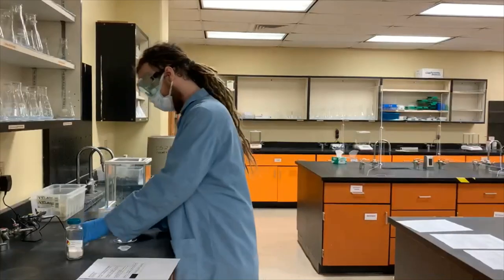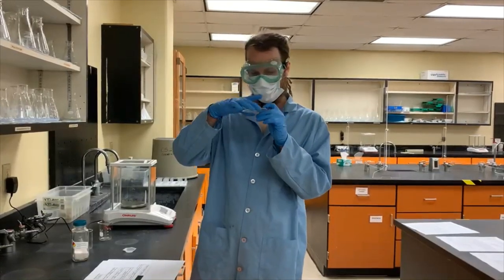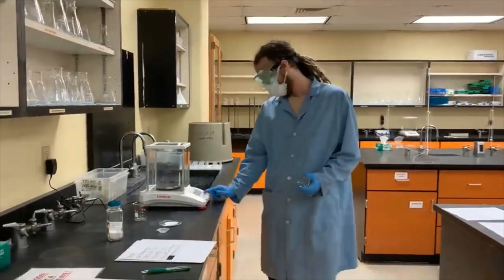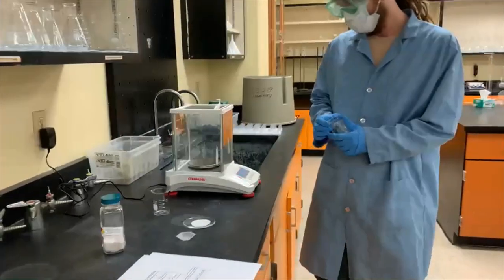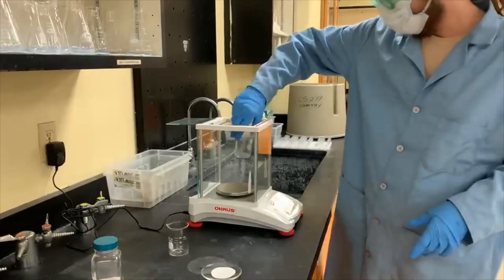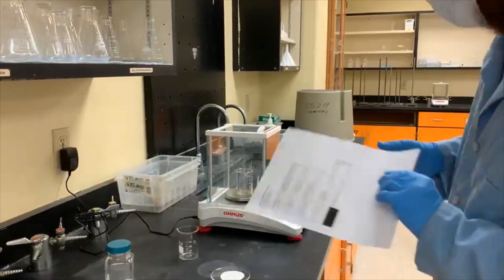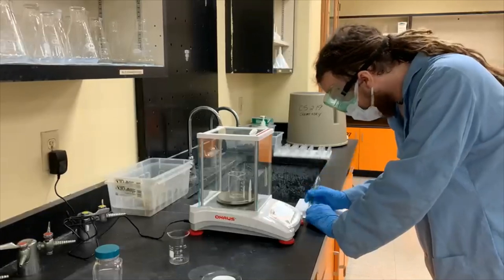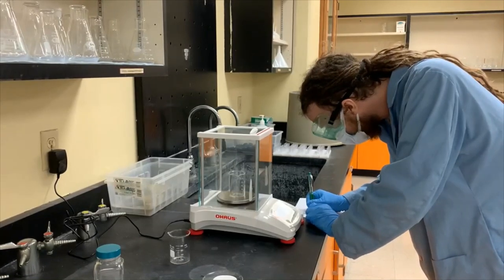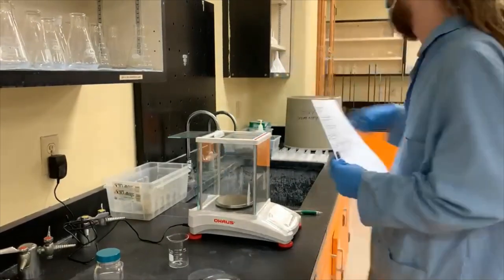2 beakers and a watch glass with filter paper on it. So first, we want to make sure our balance is reset and tared. Then we'll take the mass of the first beaker. And for that one, we get 51.163 grams. I'm gonna set that aside.